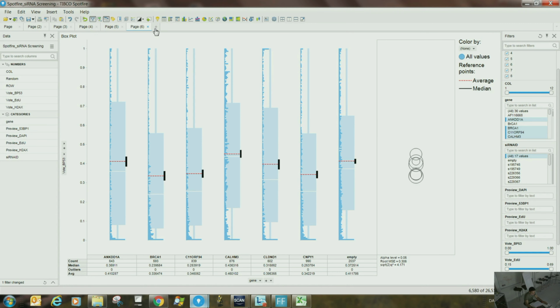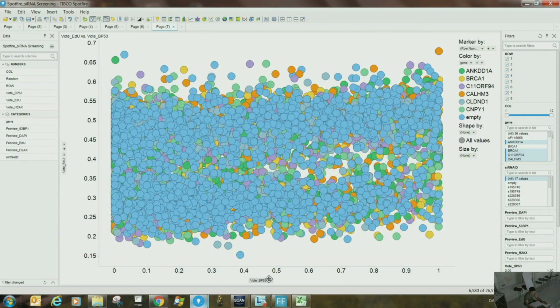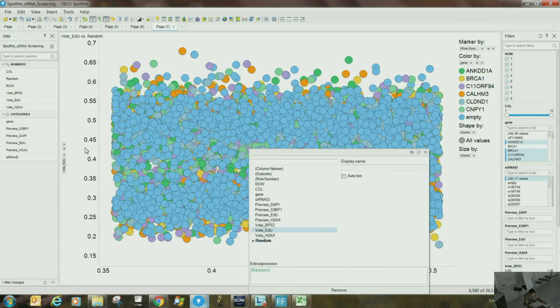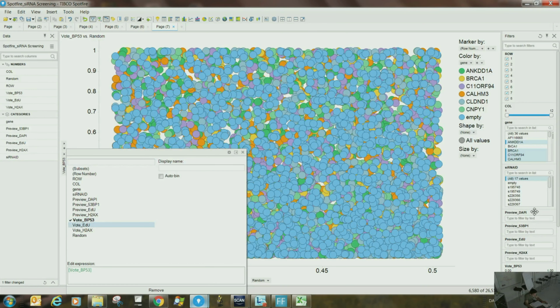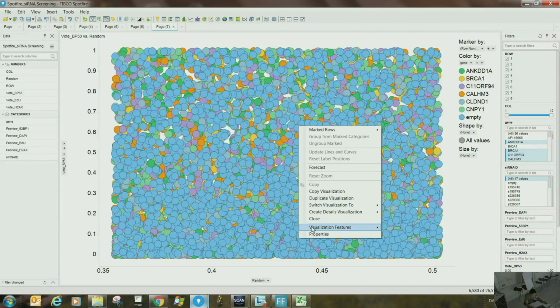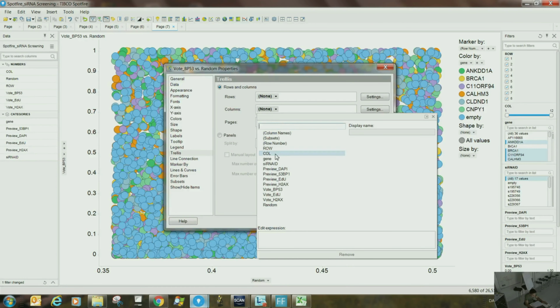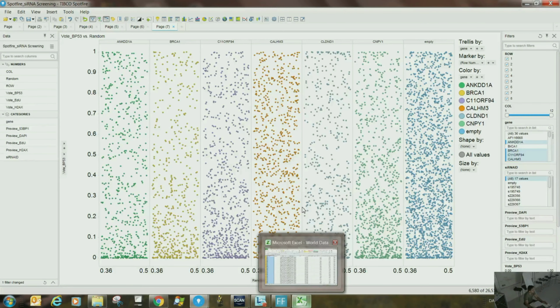By the way, as I said before, there is also the possibility of showing the scatter plot. So you just go to, what was it? This random stuff, right? 53BP1. If you select it, Properties. Really smart. That's basically it. It's kind of a box plot, but now you're showing all the individual dots basically.